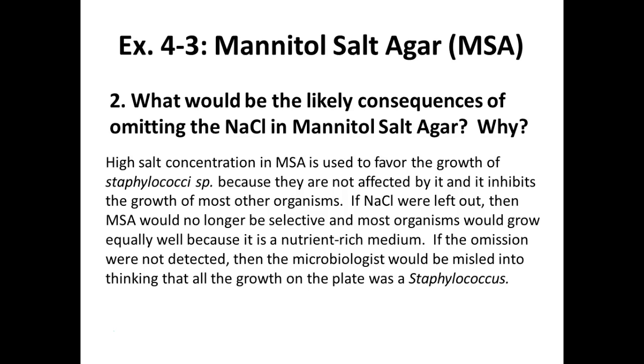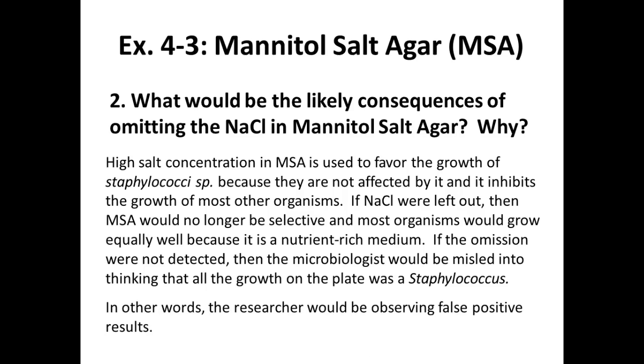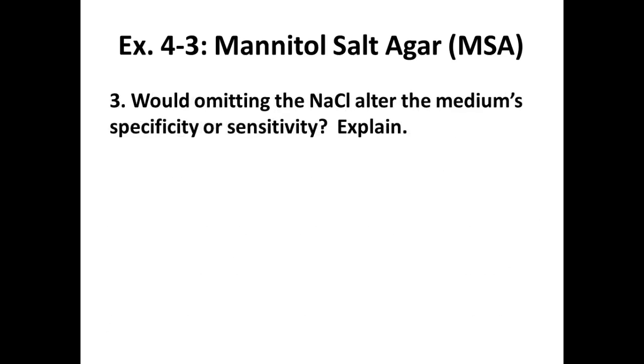And therefore, just about any organism would grow on the media. So you could have some false positive results, right? If the media wasn't made properly.